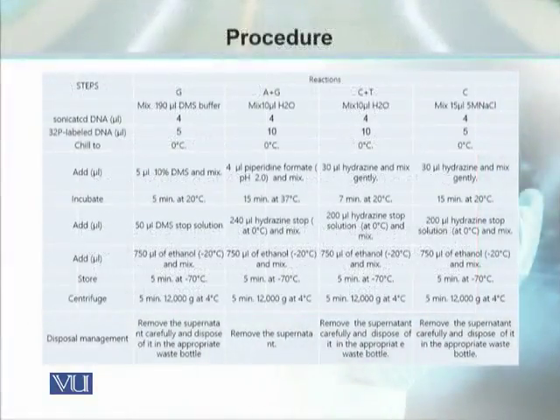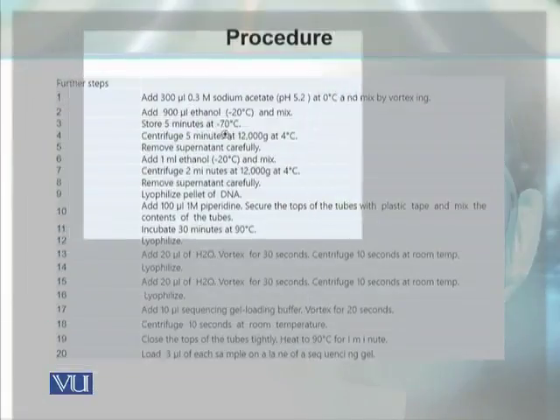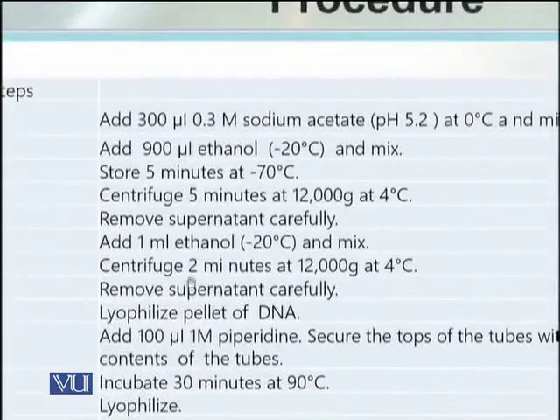Once we are through with the addition of the base modifiers and different reagents, the incubation and centrifugation steps, and removal and disposal of the supernatants after centrifugation, we have to pass through a series of centrifugation and lyophilization stages.